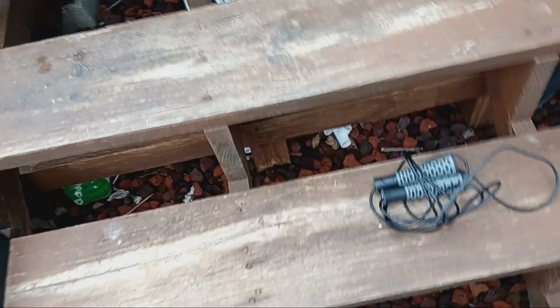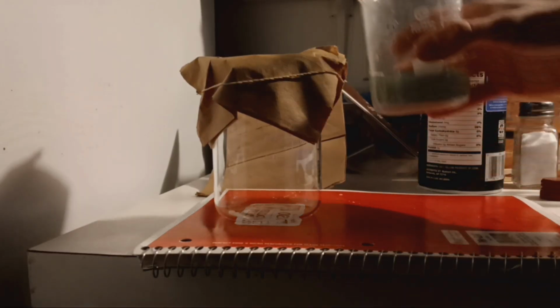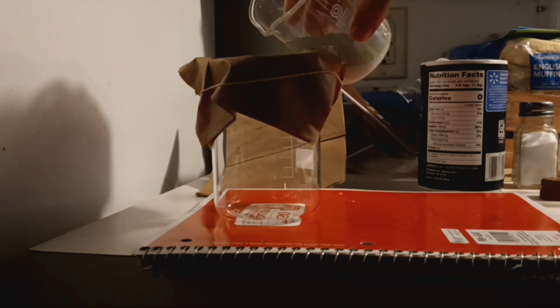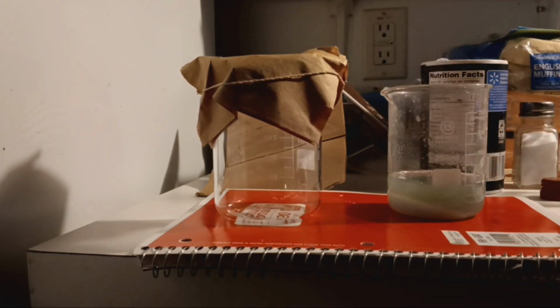The only reason I know about this so-called green rust is because I was trying to determine what the final iron oxide product was, and so I had to look at what iron oxides existed and determine it based on color. Now, I do not know much about how this green rust works, but it just does, and it's green for some reason, and it's very confusing.